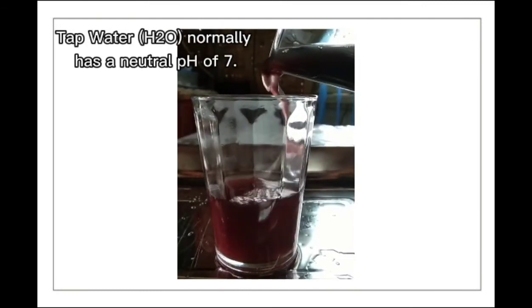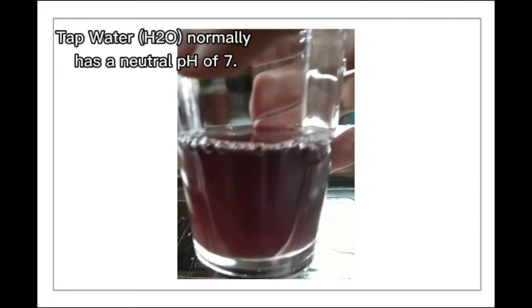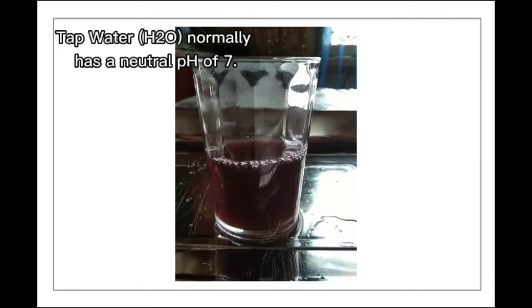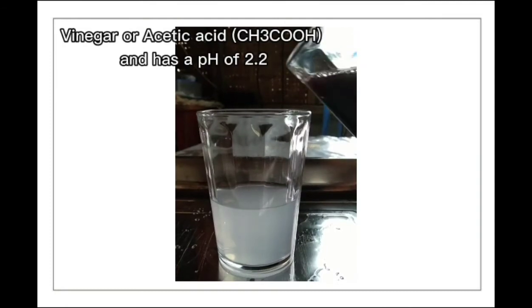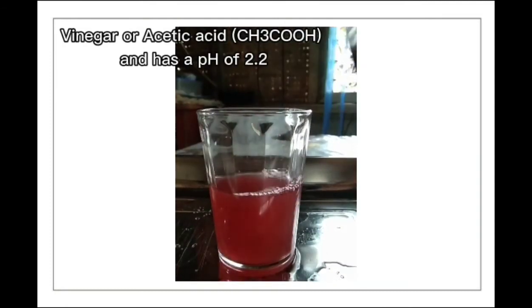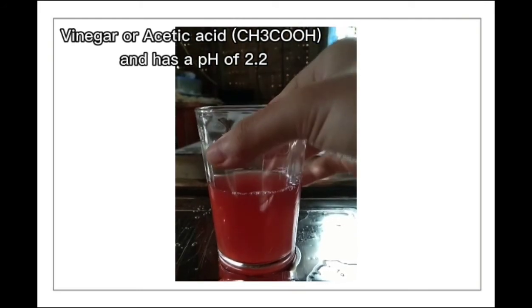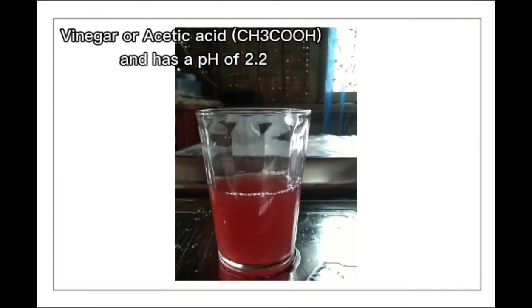The next solution we are going to add to our indicator is tap water. Tap water turns our solution a very dark red. This tells us that the tap water we tested is slightly basic but close to neutral. Vinegar is our next solution being mixed with our indicator, and it turns a very bright red or pink color. This color change means that vinegar is acidic.